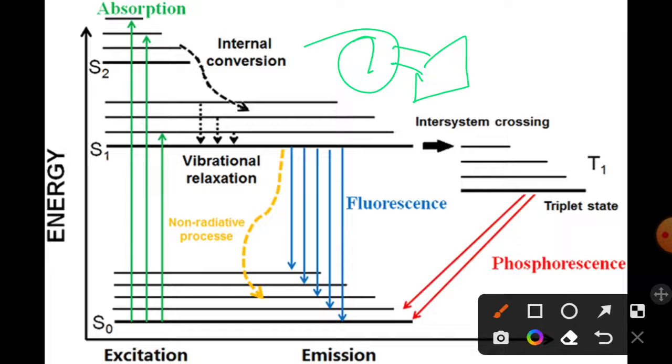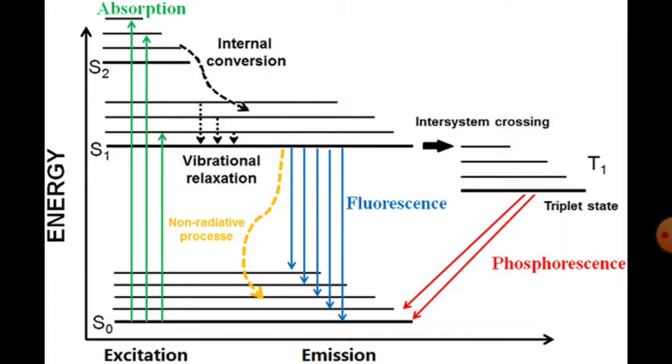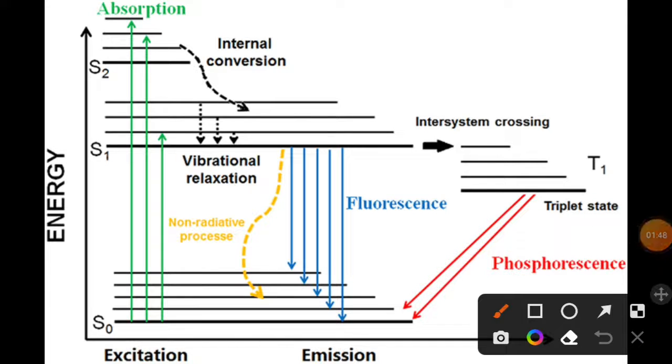Under such circumstances, we introduced lecture number 3, where we saw dark field microscopy. Here we use an annular stop under the condenser, which allows only a hollow cone of light to pass through the sample, and the rest of the light is blocked by its slit. So here we are simply reducing the amount of light, and that allows us to visualize live samples under low illumination. But here we faced a new problem: due to such low illumination, we cannot distinguish between the cells and the artifacts, that is, our impurities.